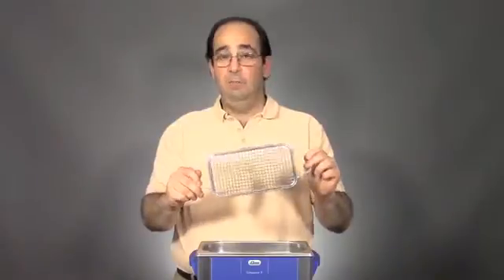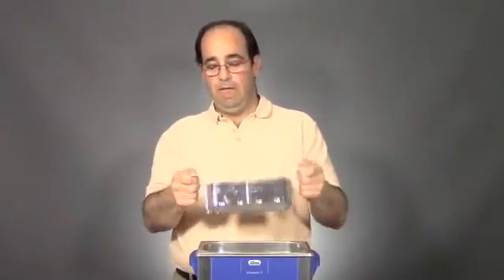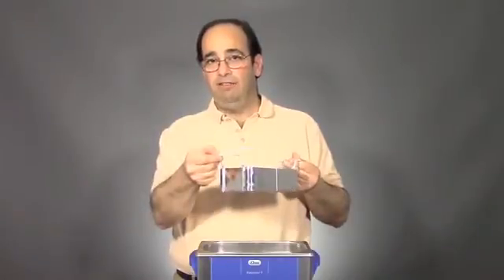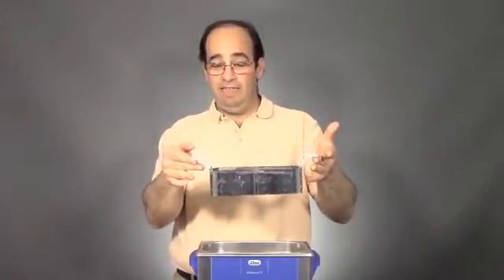The basket is made out of stainless steel, it's tough and durable, and it has these great plastic coated handles. It makes it easy to put your stuff in and take it out of the tank.